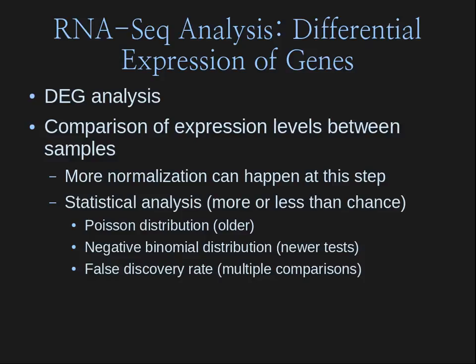One thing that people do is start out using RNA-Seq. We can screen for almost every gene and see what looks like it's differentially expressed. This will narrow it down. Then once you have a handful of candidates that are looking good, you follow that up with qPCR.